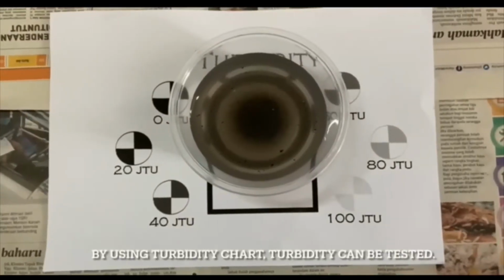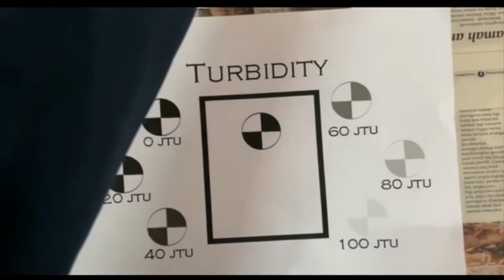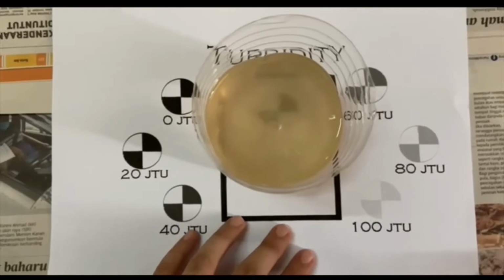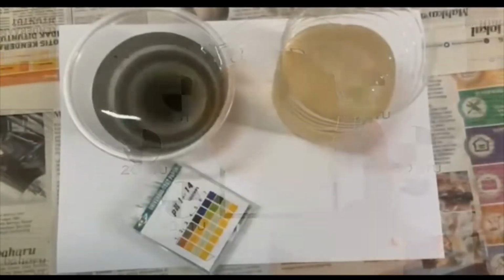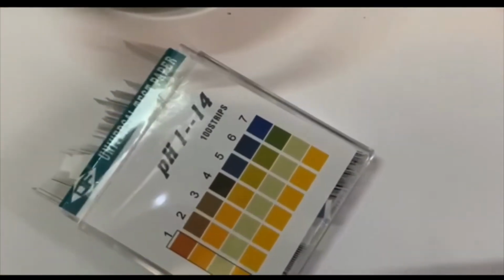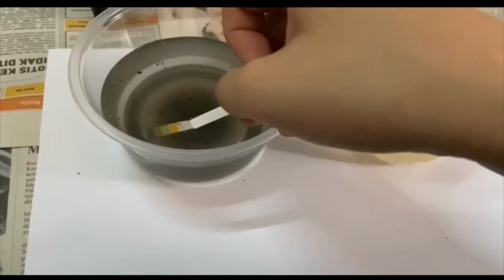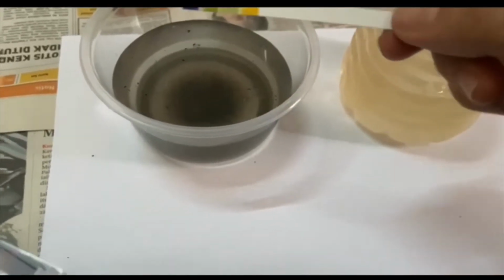Turbidity test: synthetic water recorded 100 JTU, and then the wastewater recorded a value of 60 JTU for turbidity. The other parameter used is pH value. It is recorded that the synthetic water is slightly more acidic than the wastewater.